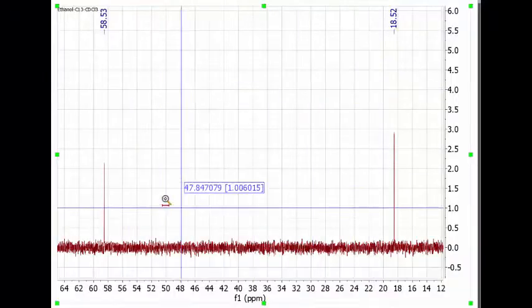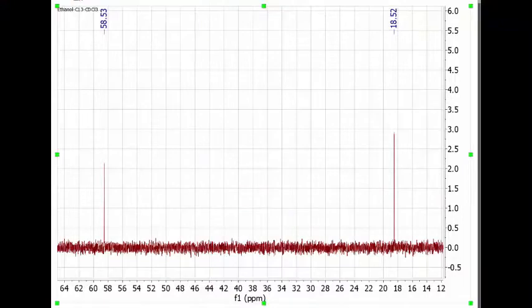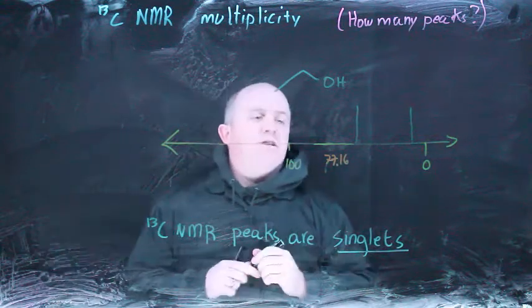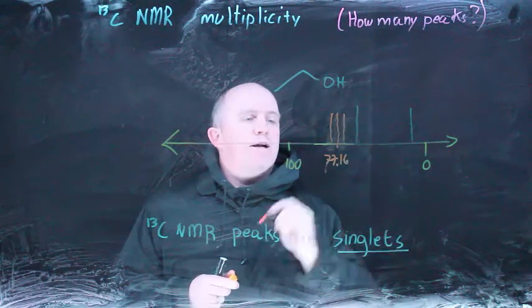See, this is what I'm talking about. We got 2 lines. The one near the oxygen and the methyl. Singlets. Zoom out? Why should I zoom out? Oh, what's that? I'm being told by my fake producer that I really should pay attention to the fact that I already told you that 77.16 for CDCl3 is always going to show up as 3 lines.